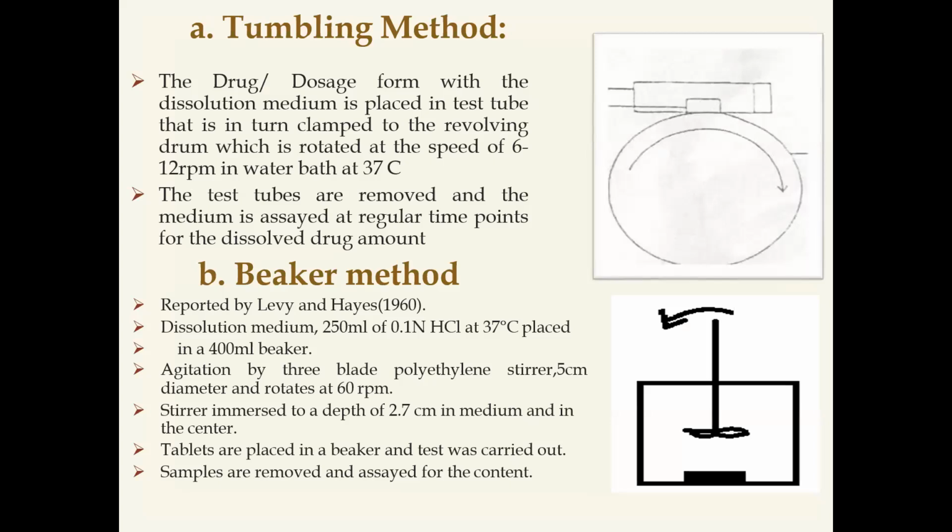Next one, forced convection non-sink methods. This is the second one. In this, I think four methods are there. First one is the tumbling method.